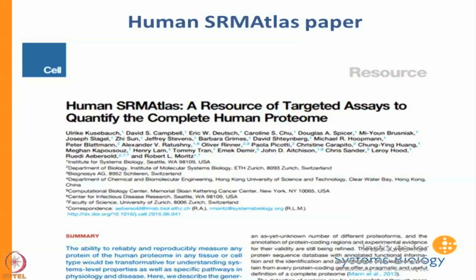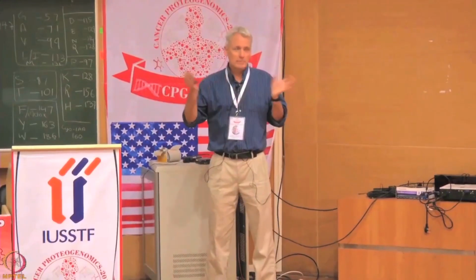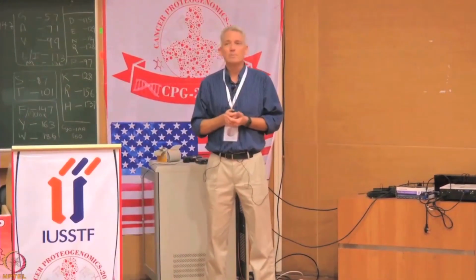To do that, we basically took UniProt and made at least five peptides for every protein based on things that had been seen in the past. And we actually used synthetic peptides, so that we had a high confidence of what we were looking at. And for longer peptides, we took up to 10. Basically, this gives us an ability to look, in theory, across the entire proteome.